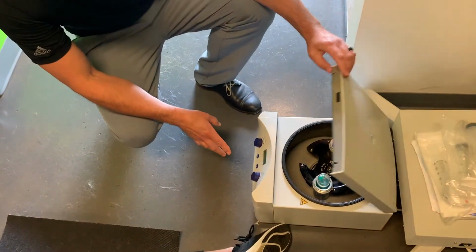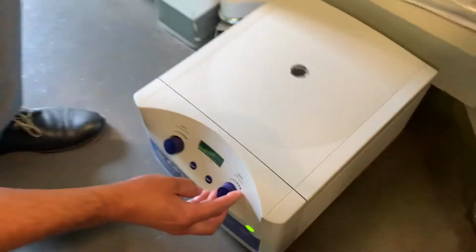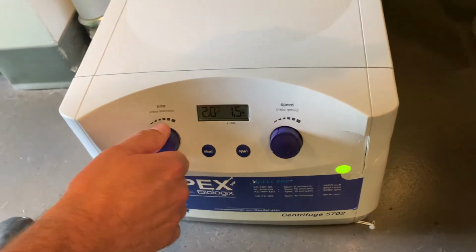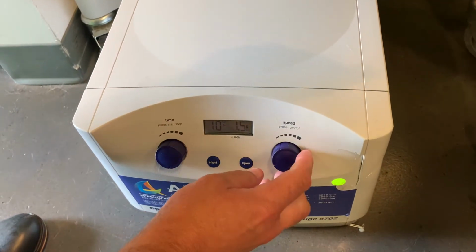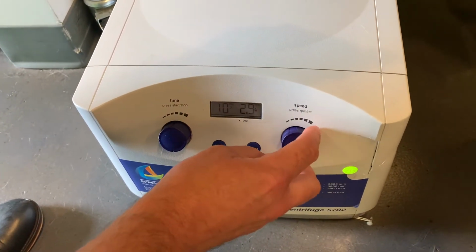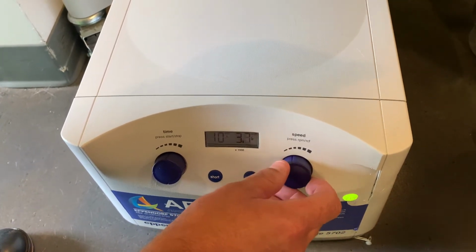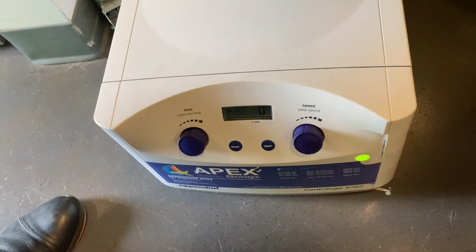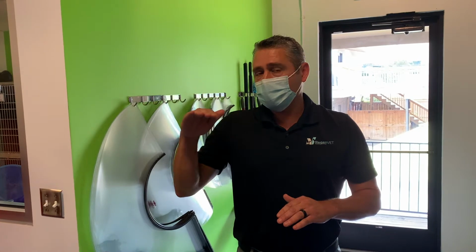So at this point, we close the lid, that locks down, and we are looking for, if you can see that on there, 10 minutes at, we're in RCF, at 3,800 RPMs, and then we press start. So that is going to slowly speed up. Once it gets to 3,800 RPMs, it's going to start the countdown from 10 minutes.